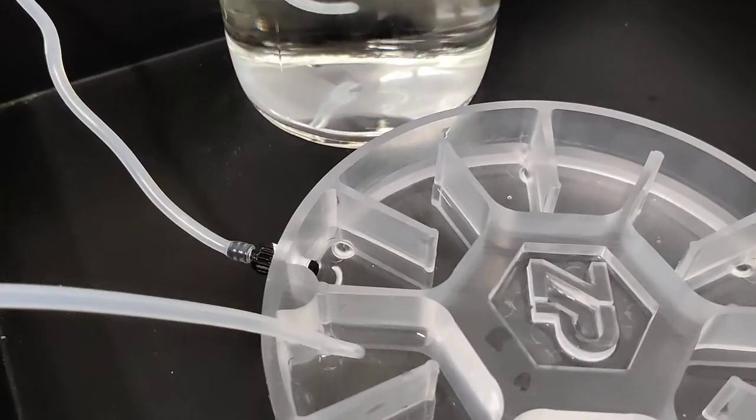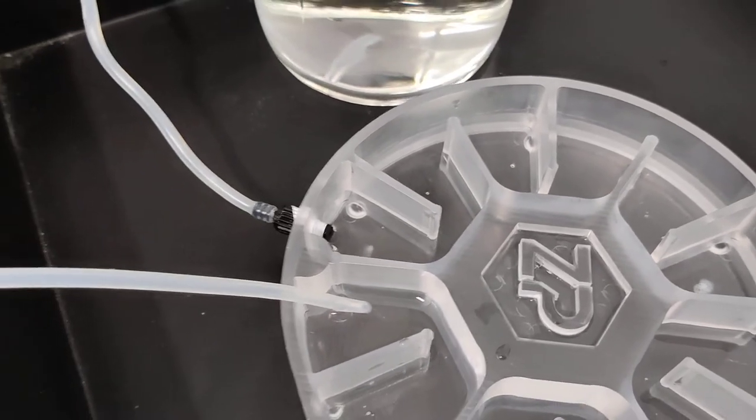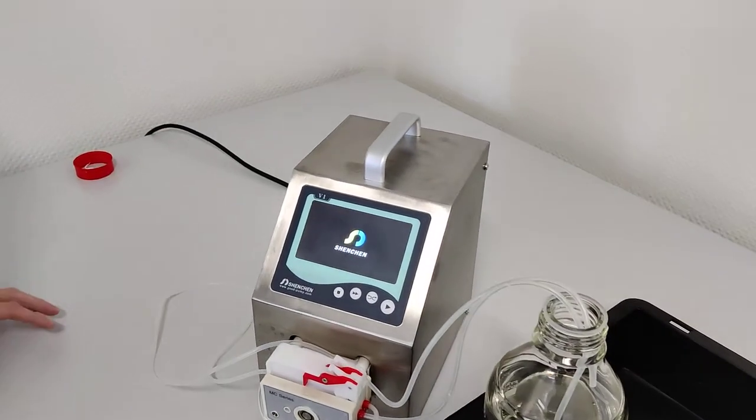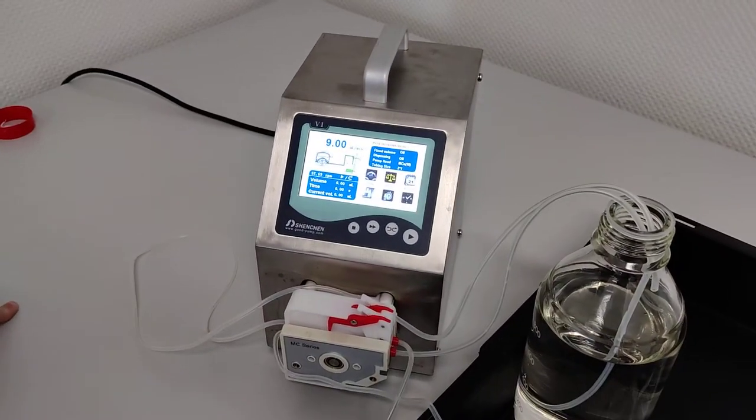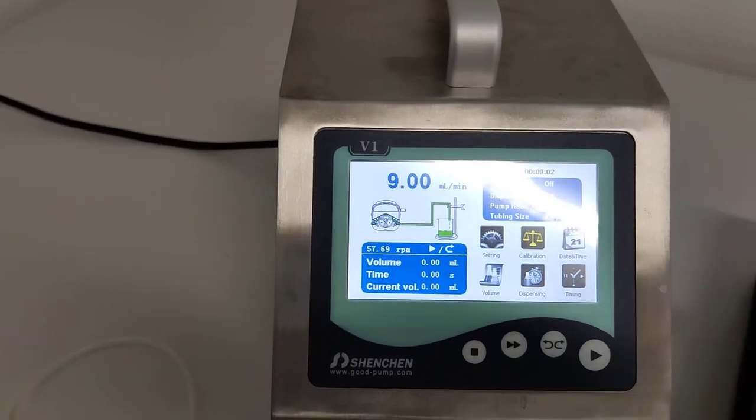So now we can see Anna has filled up approximately to the same height as the outlet. So please turn on the pump. There we go. And now we set it to nine milliliters per minute.